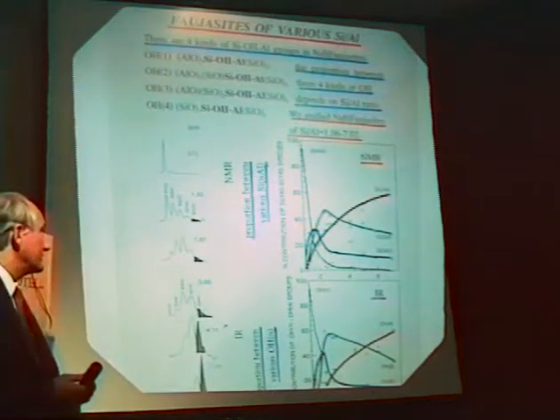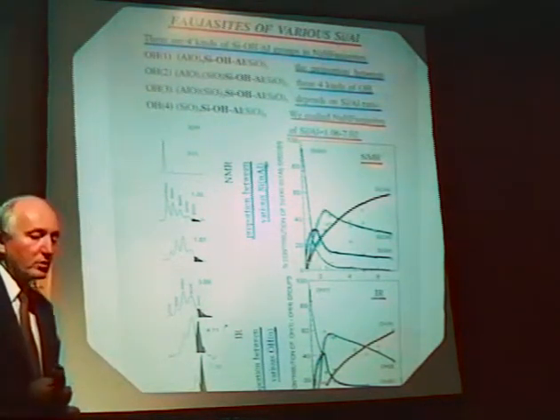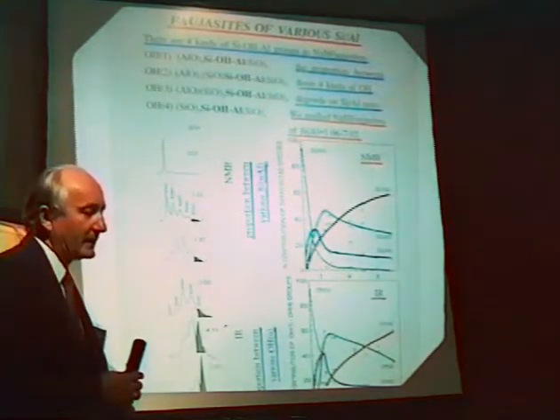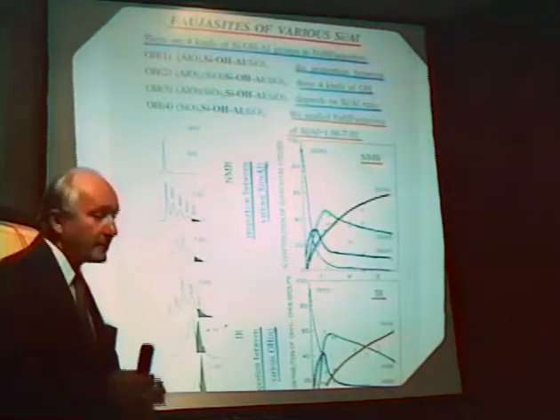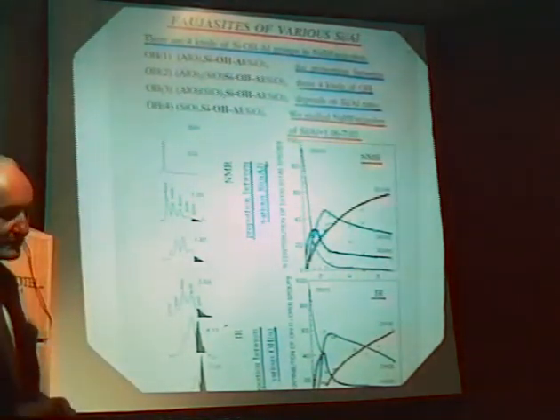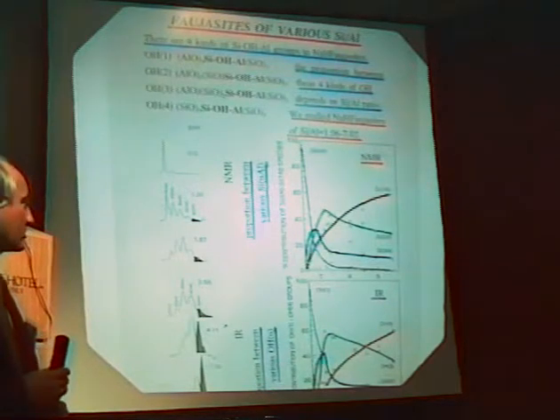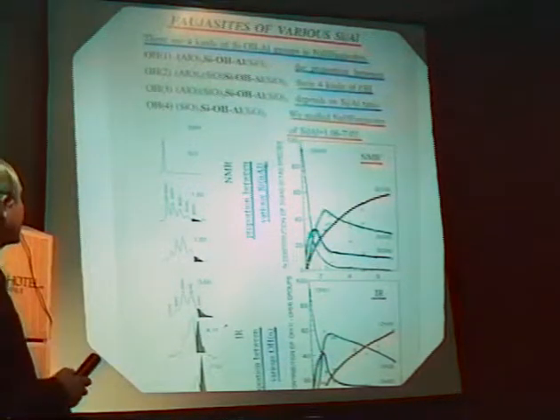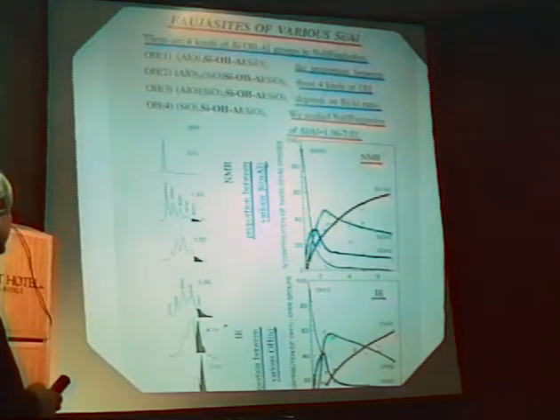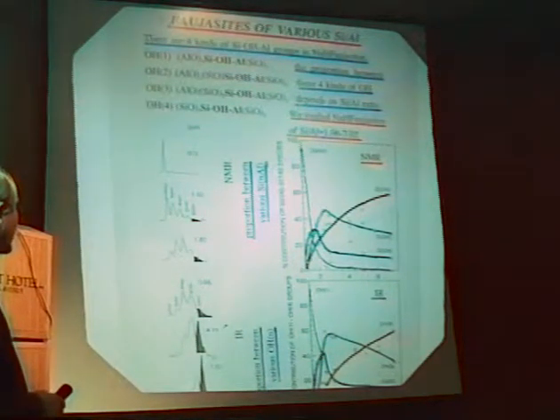At that moment, we decided to look for a quantitative correlation of NMR and IR data: NMR concerning skeleton Si and IR data concerning hydroxyl groups. We studied a series of 15 faujasites of Si to Al from 1.06 to 7.02. It means faujasites of various Al contents.